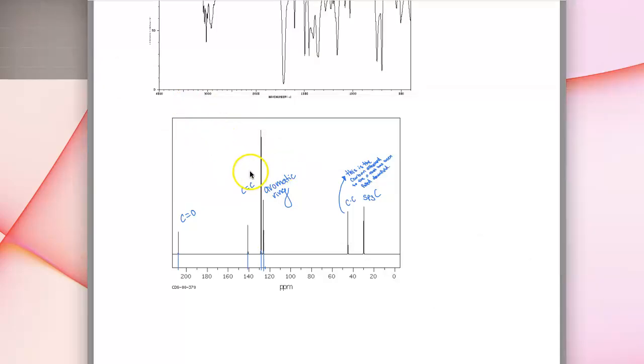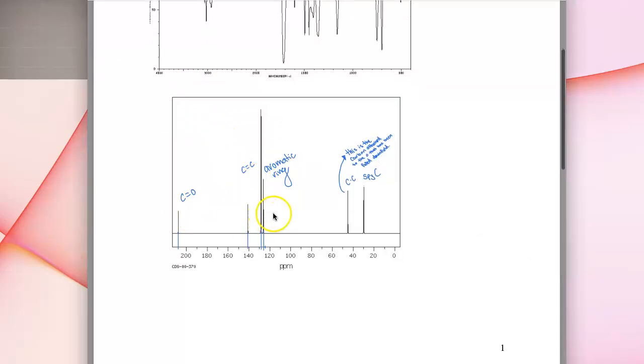So with that, we see that it does have the three peaks here, as being our carbon-carbon bond and our aromatic ring, which is a little different. So we see that it has, because this is our carbon-carbon bond, and it signals for an aromatic ring or a benzene or phenol in there, and it has 3 carbon double bond carbon in there. So we have 1, 2, 3 peaks.